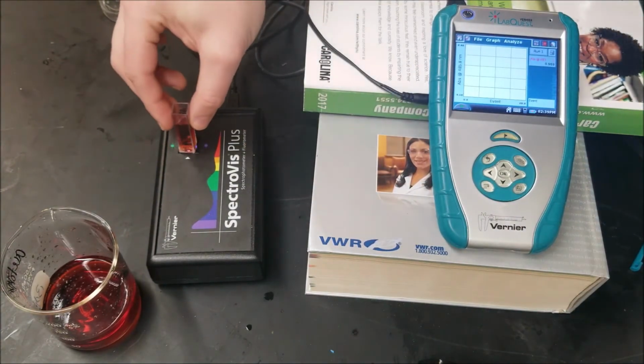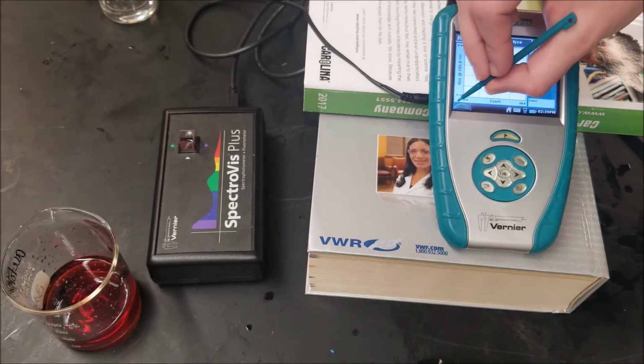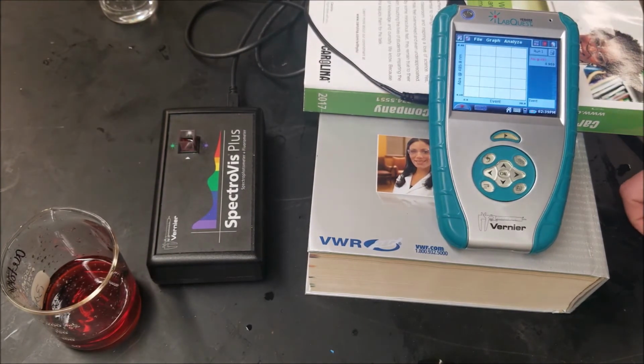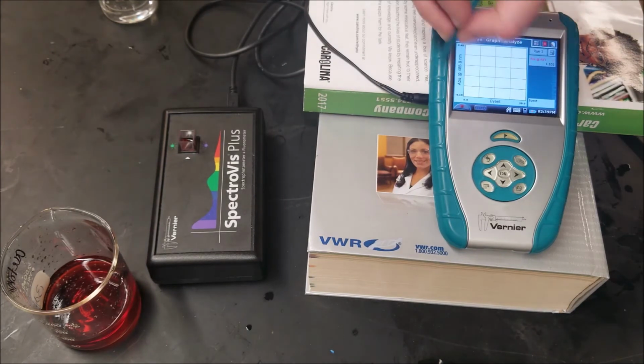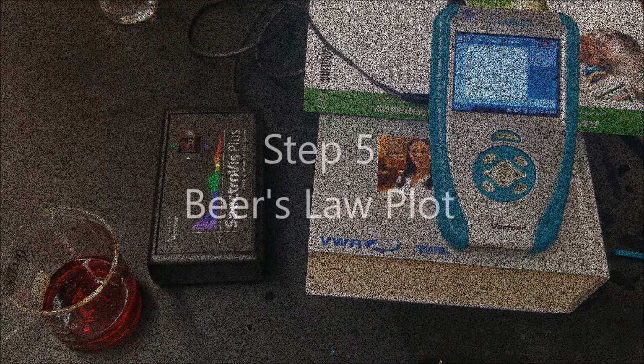Put this in. Last one. 0.110. Now I'm going to save these for now on the off chance we need them, but we should be done with them.